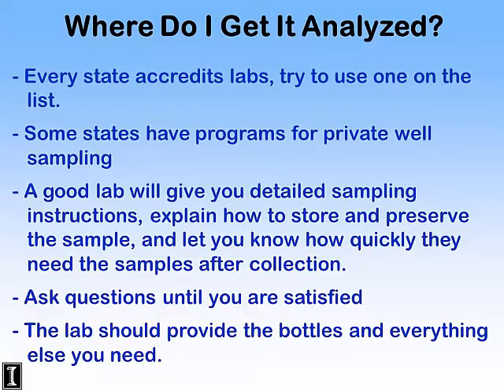So where to get it analyzed, as I mentioned, every state accredits labs, and so does US EPA for community water supplies. In general, I would say you're better off ensuring you use one of those labs. They've passed a lot of quality controls. I say that knowing the Water Survey's lab is not accredited, but it's a lab. It's very helpful for well owners. And so we have a program for private well sampling here, and originally it was free until about 2006, I think. And now it's a very small fee that gives well owners information on inorganics and metals to help them understand their water quality better.